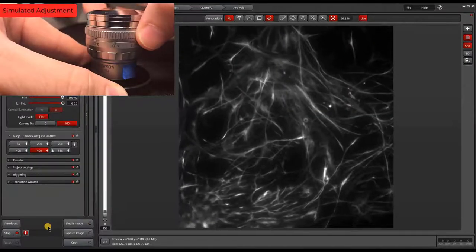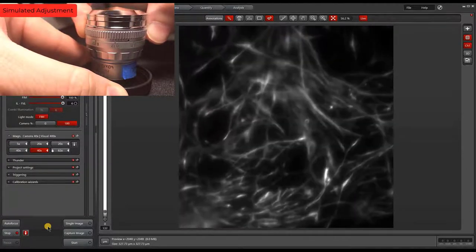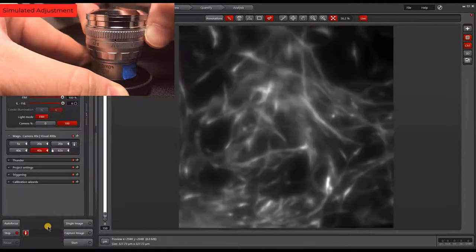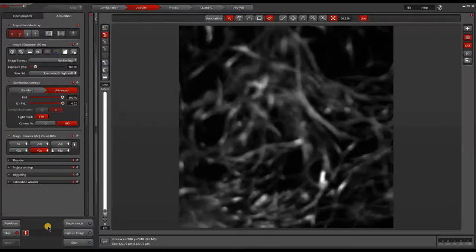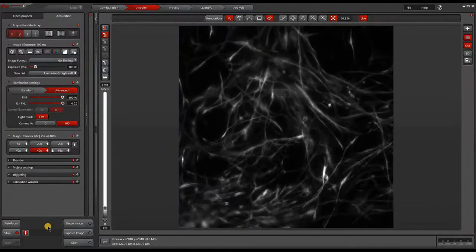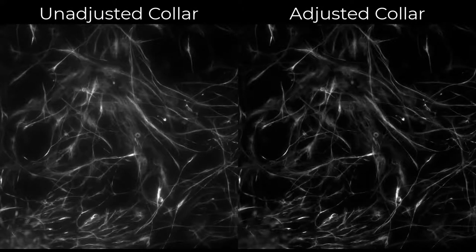We'll once again adjust the correction collar while viewing the live image. The inset is also demonstrating the adjustment being made. After finishing the adjustment, we will take a second image for comparison. As you can see, the adjusted image is much better quality. Be sure to always use a cover slip sample with this type of objective. It's also important to note the type of cover slip on your sample so you know what the collar should be set to.